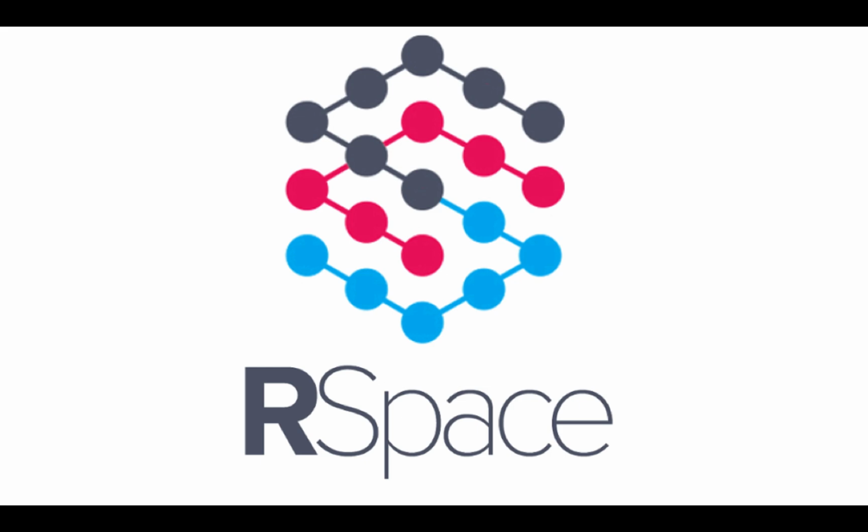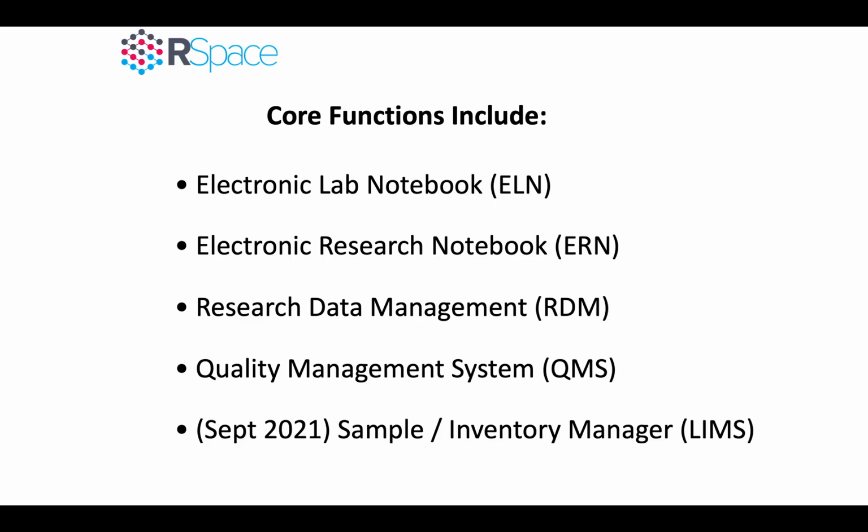RSpace is a modern electronic lab notebook and data management solution. The core features of RSpace include everything you'd expect in a modern electronic lab notebook, but RSpace's unique flexibility also allows RSpace to be used in any modern research sector. Because of this flexibility, we often refer to RSpace as an electronic research notebook, or ERN.